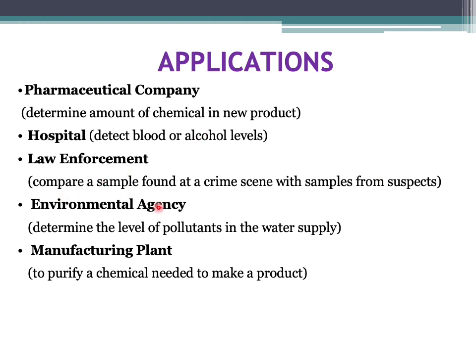For the environmental agency, for example, to determine the level of pollutants in the water supply, or for the manufacturing plant, to purify a chemical needed to make a product. So, maksudnya kat sini application ni dah meluas. Chromatography memang digunakan untuk pelbagai applications.